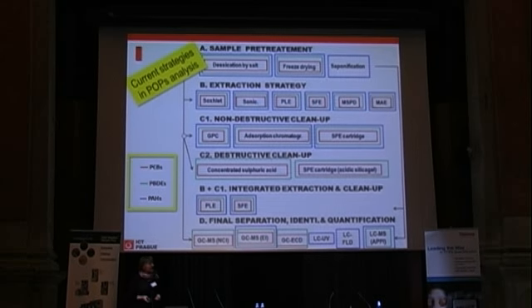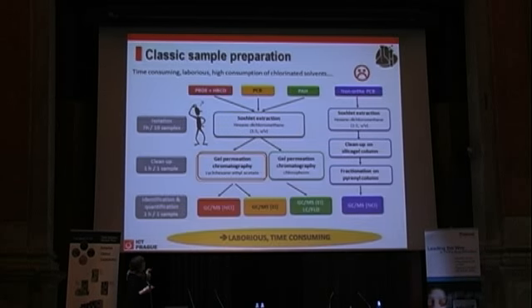When you go to real-life laboratory work, giving an example of our approach at that time, we had accredited methods for different target POPs. However, with the exception of the Soxhlet extraction, we went through different pathways, and we ended up with different chromatographic approaches. Moreover, for planar PCBs, we had a special method apart. So it was really, as pointed out here, a lot of labor, a lot of time demands we had spent on these monitoring programs which were targeted on these POPs.